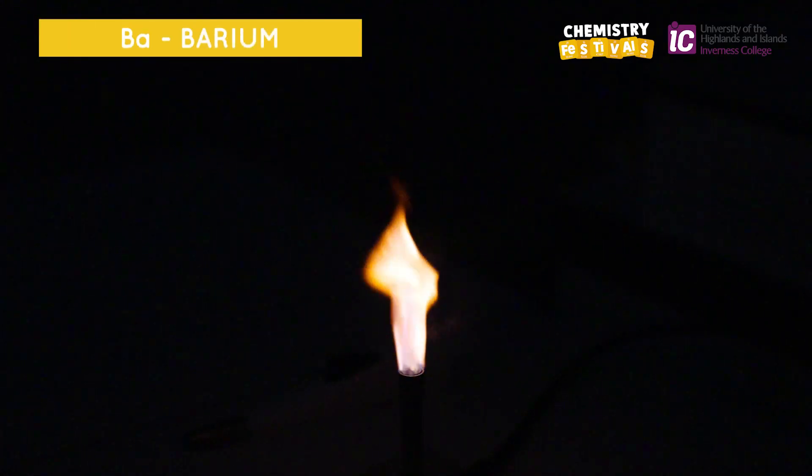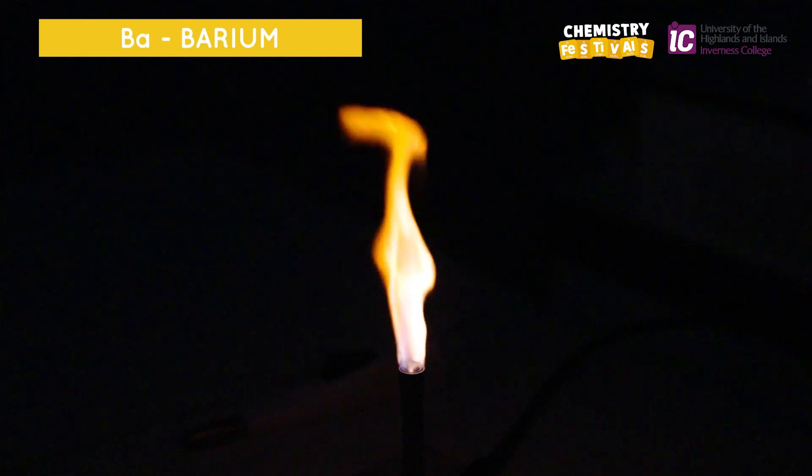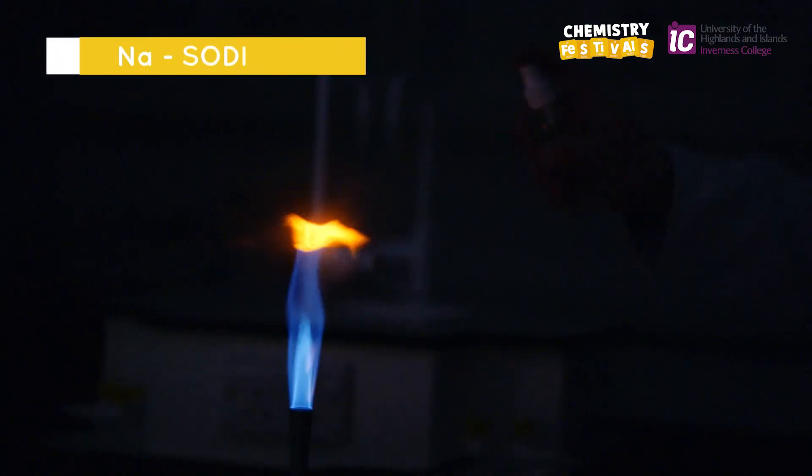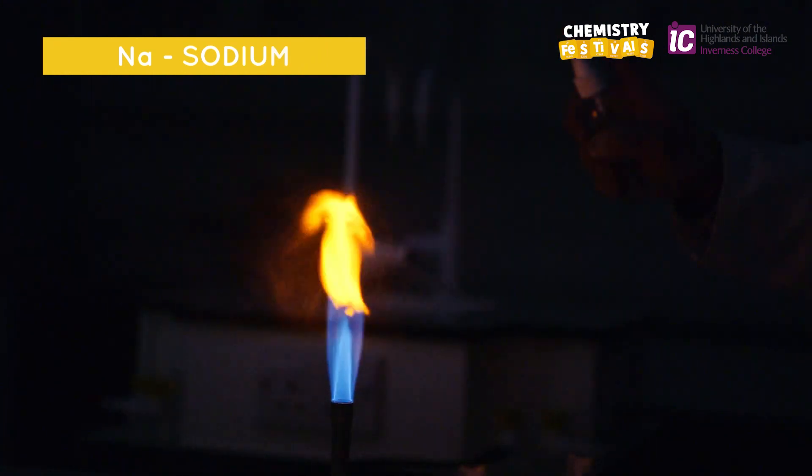I'm spraying metal E, barium, and this produces a yellow flame. I'm spraying metal F, sodium, and this produces a bright orange flame.